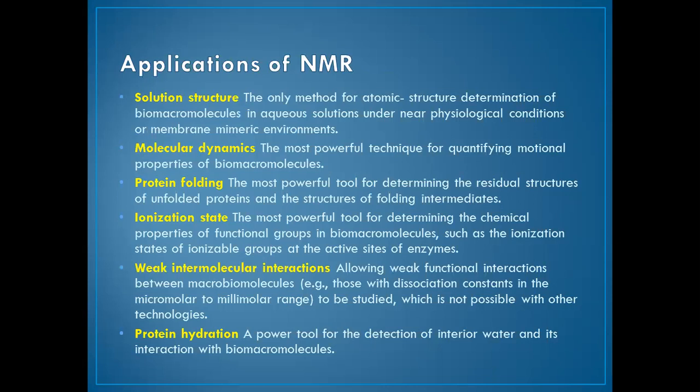First of all, solution structure. It is the only method for atomic structure determination of biomacromolecules in aqueous solutions under near physiological conditions or membrane environments. Second, molecular dynamics. The most powerful technique for quantifying motional properties of biomacromolecules. Third, protein folding. The most powerful tool for determining the residual structures of unfolded proteins and the structures of folded intermediates. Fourth is ionization state.